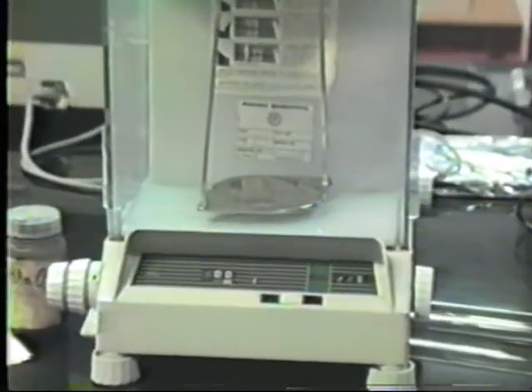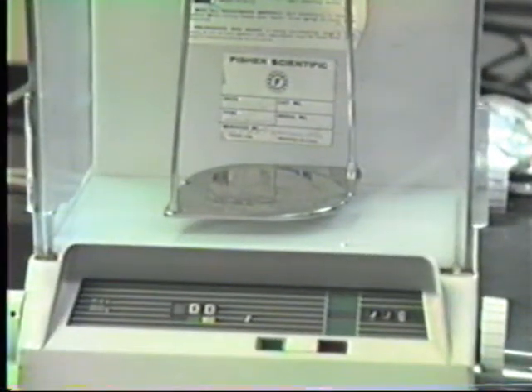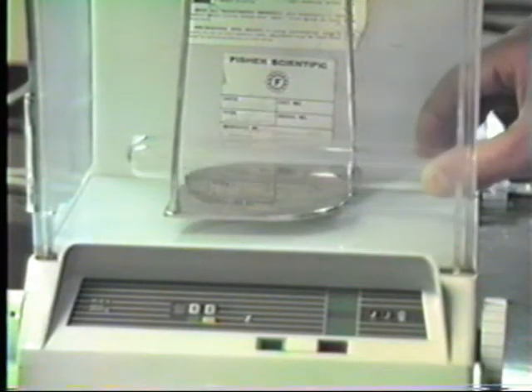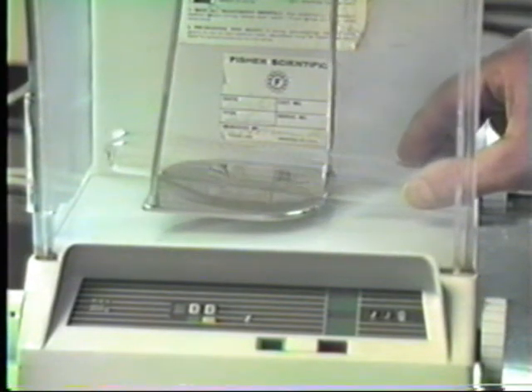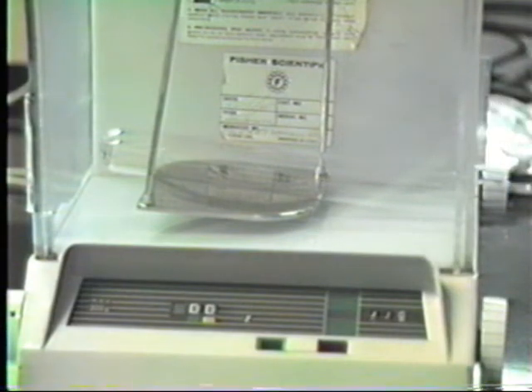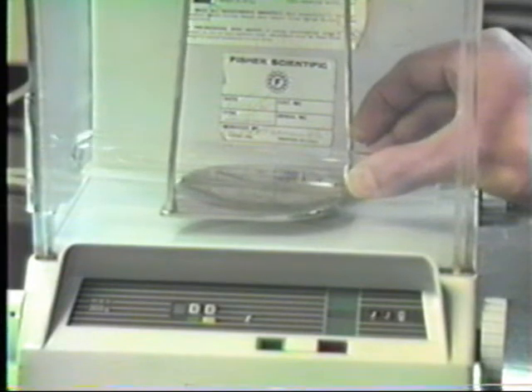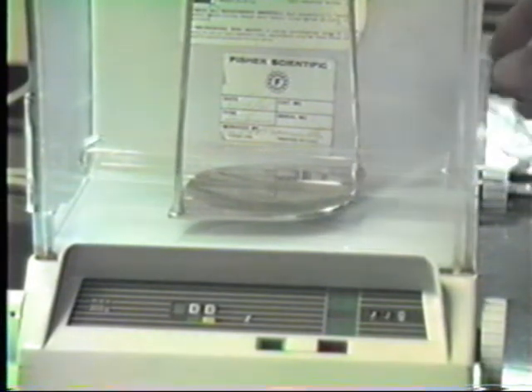Now, in weighing here, there are a couple of other precautions which we'll use. Make sure that when you put things on the balance pan, you use these little slots in the balance pan to hold your test tube. And when you put your test tube on, make sure that the test tube is in such a position so that it does not tilt the pan and give you bad results. Make sure that you have the pan level when the test tube is on.